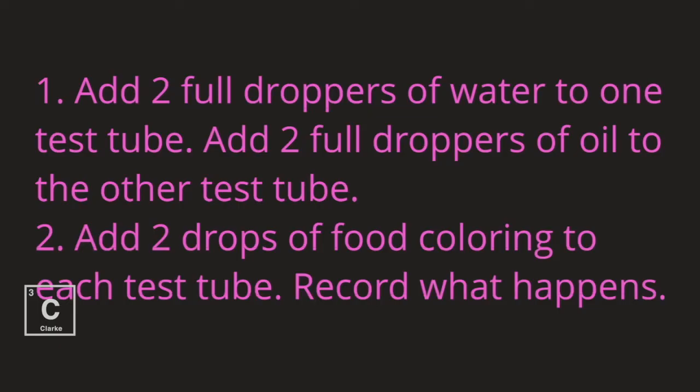Add two full droppers of water to one test tube. Add two full droppers of oil to the other test tube. Add two drops of food coloring to each test tube. Record what happens.